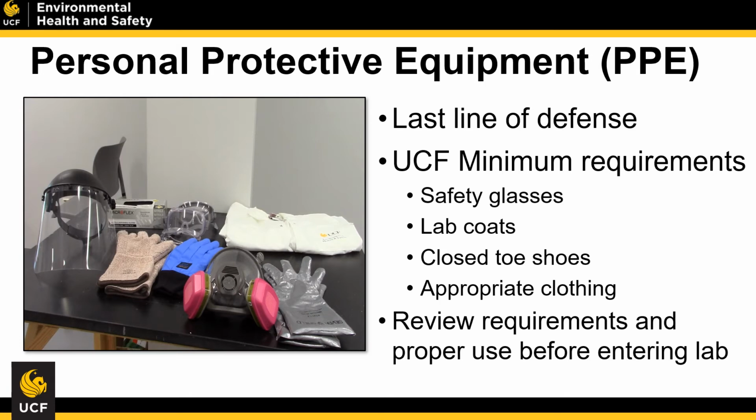The way that you would identify that your lab safety glasses meet this standard is if you were to look inside along the brim, there would be some marking to indicate that it's Z87.1.